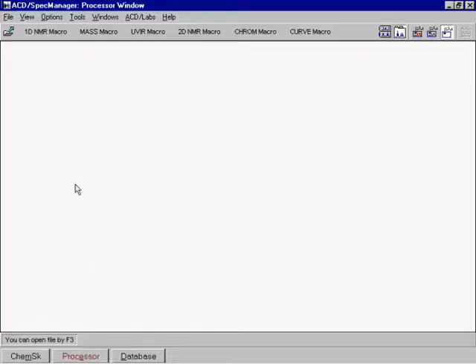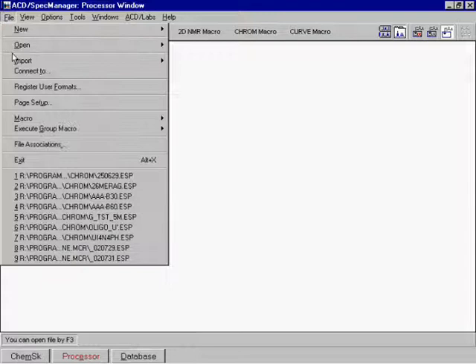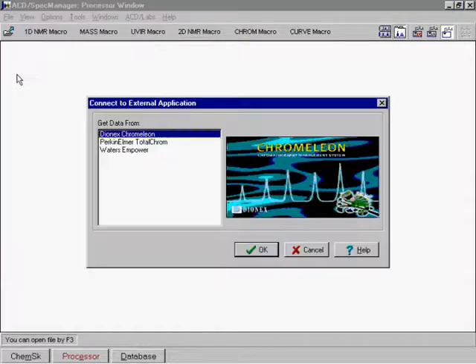Connect to Perkin Elmer Total Chrome software from within the ACD Chrome Manager interface.